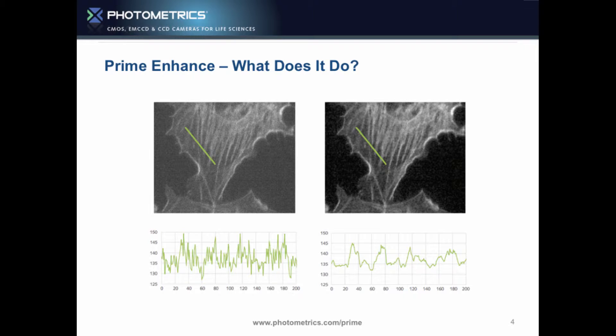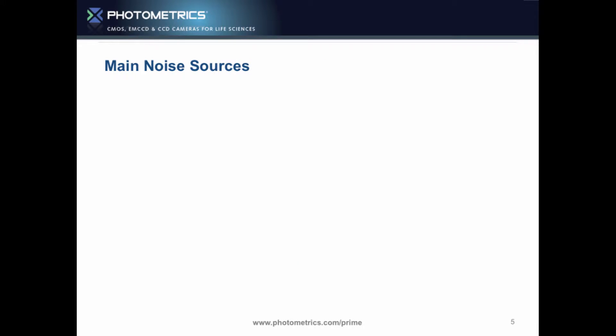So let's look at Prime Enhance. What does it do? Its job is to take an image with high noise and reduce the noise inside it, improving your signal to noise. It's going to give you a better image by turning it on, or it's going to allow you to have less light for the same image quality, and therefore have less light on your cells, less photobleaching, less phototoxicity. Your cells will live for longer. We can also maintain the intensity, so we're not doing any damage to our image.